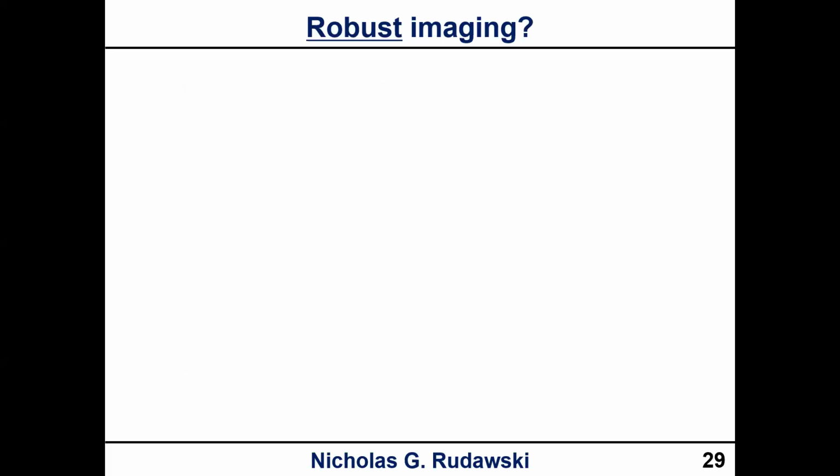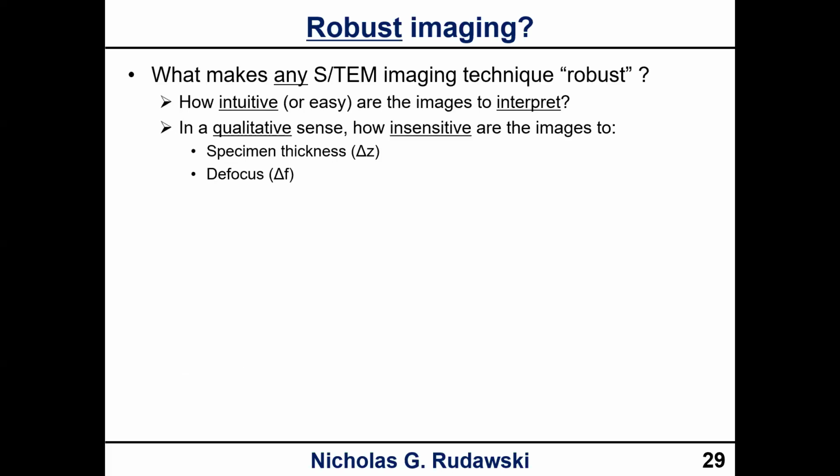Before we get to that, I want to introduce the idea of what is a robust imaging technique. What makes an imaging technique robust? It has to do with how intuitive the images are to interpret. In a qualitative sense, how insensitive are the images to certain variables? Two of the main ones are the thickness of the sample and the focal state of my lens.